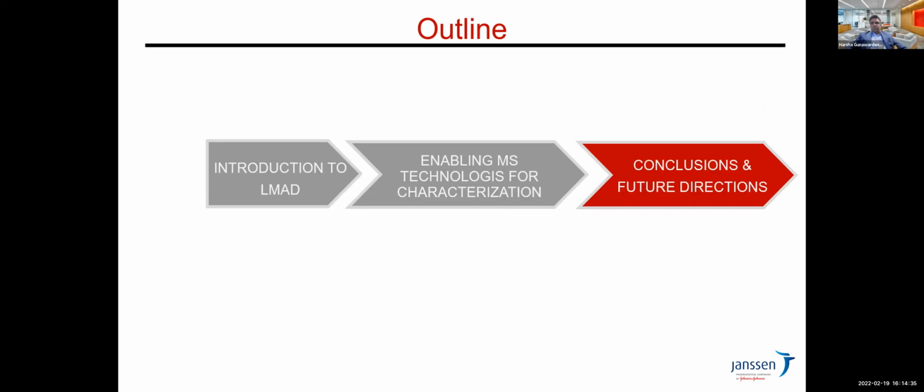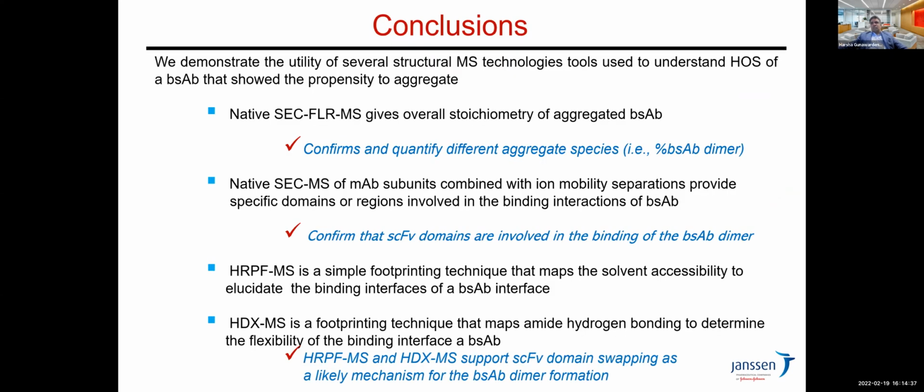In conclusion, I hope I was able to demonstrate the importance of structural MS and what structural MS methods bring to the table in early development. I showed how we used multiple technologies to understand the structure of a bispecific antibody that was prone to aggregation as well as dimerization.